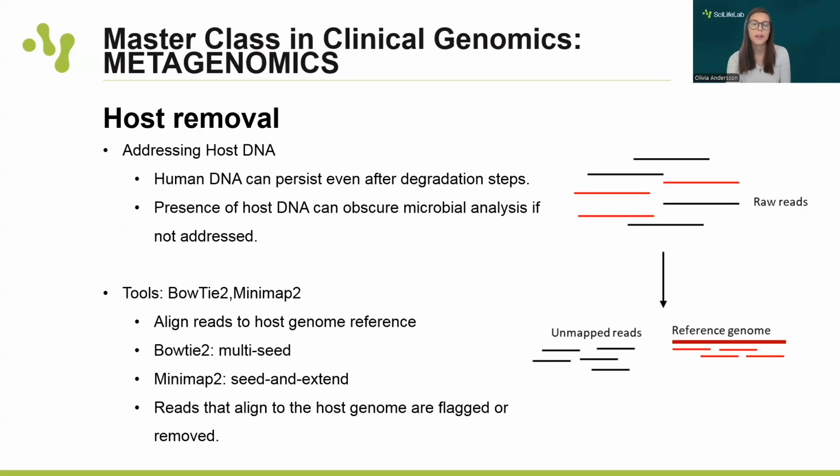To remove host DNA bioinformatically, the sequencing reads are aligned against a reference genome, and any reads that match are flagged and removed to ensure that only microbial DNA is left for further analysis.